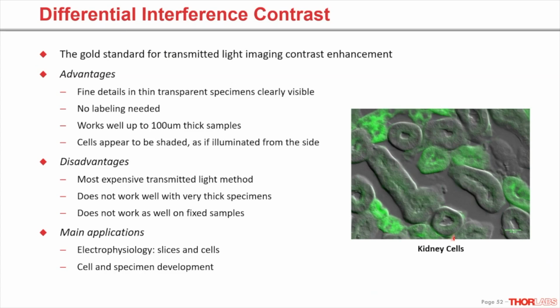Another advantage is it can actually be paired with other imaging modalities, such as fluorescence, as you see here in this kidney cell slide.